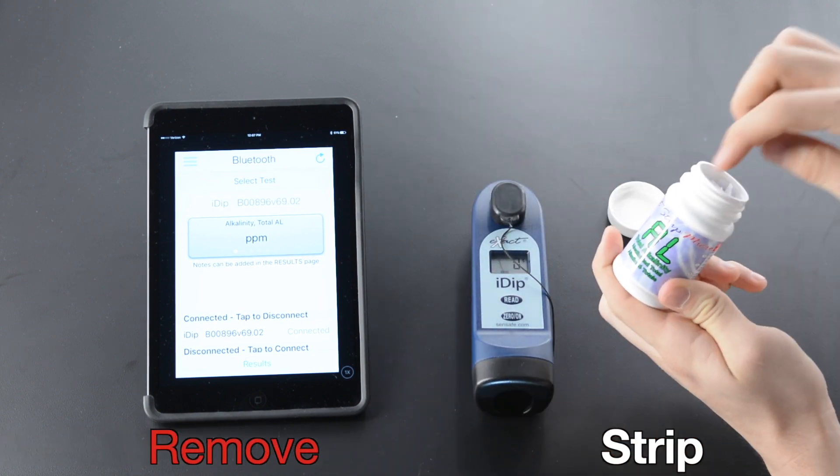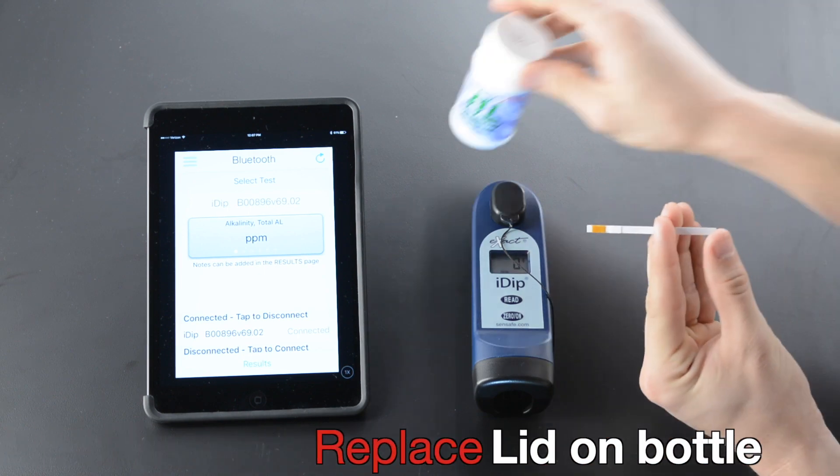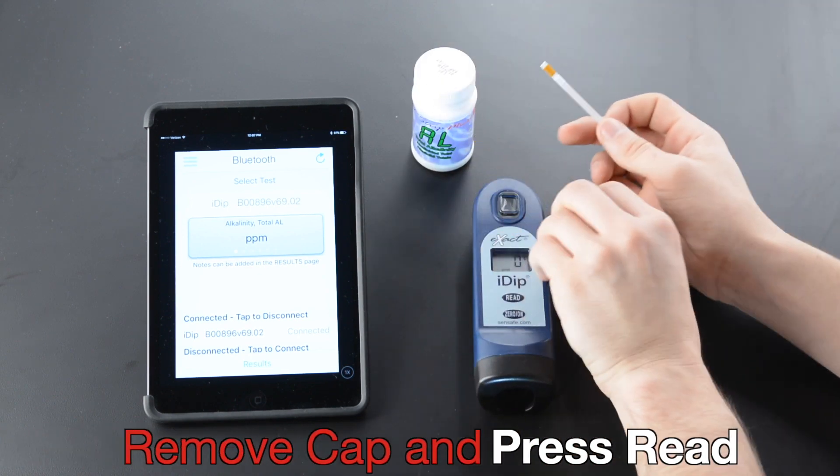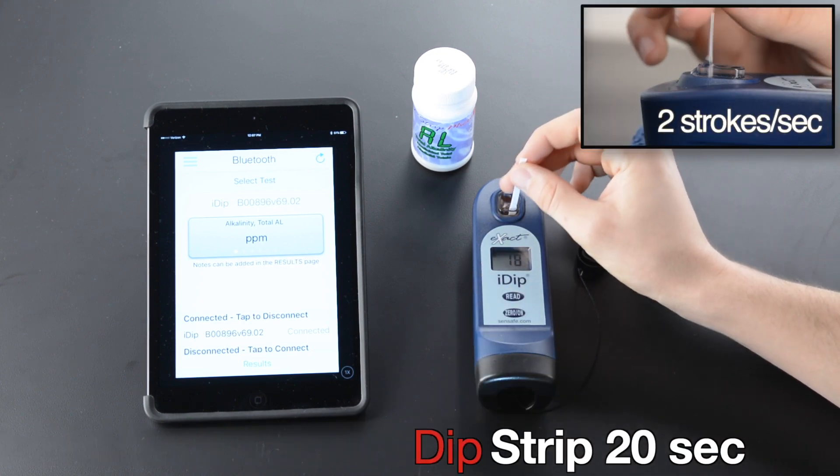Remove strip. Replace lid on bottle. Remove cap and press read. Dip strip for 20 seconds.